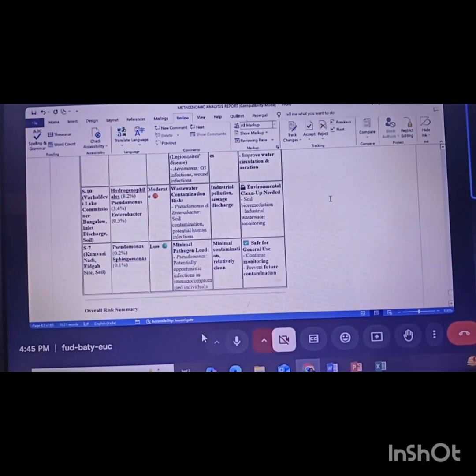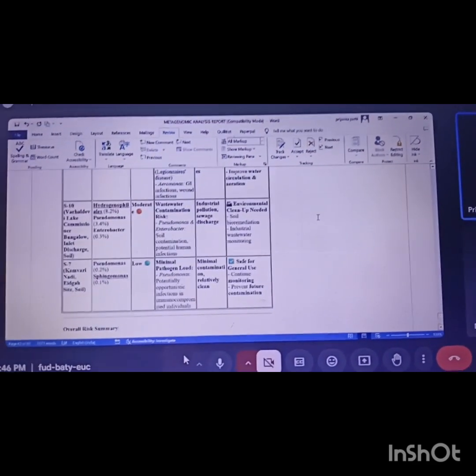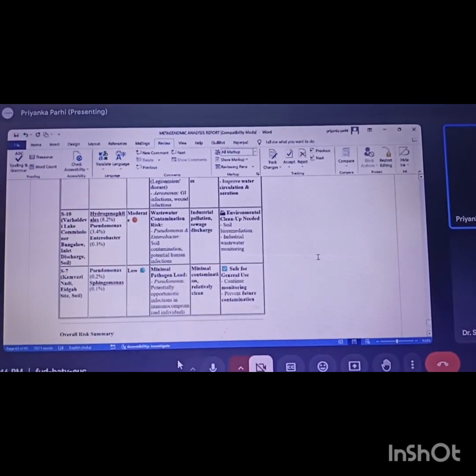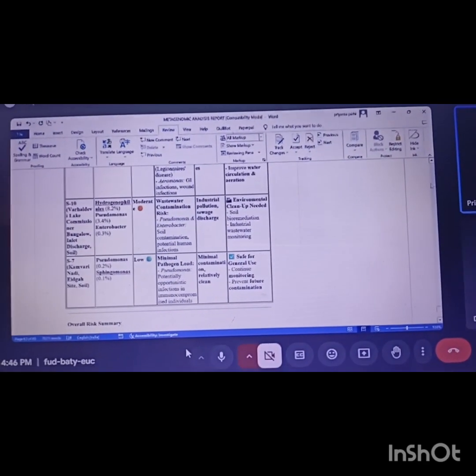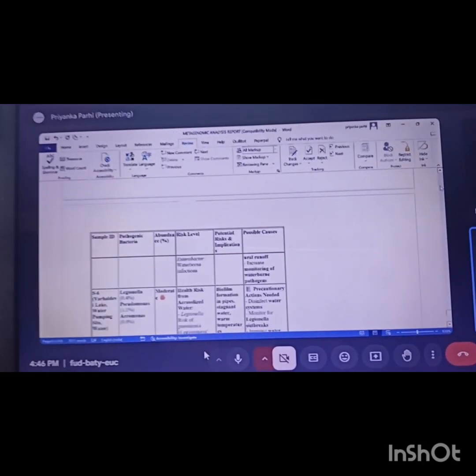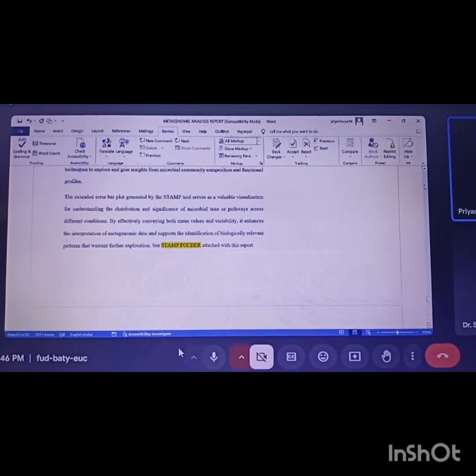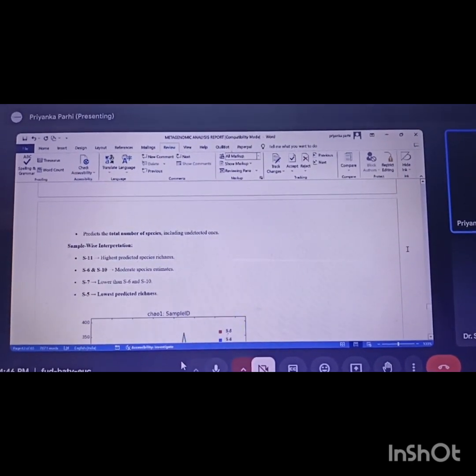Number of hits means again and again reoccurring, so repeatedly, stably occurring species. But if it were in percentage, okay, percentage you are saying we are not counting. That's why there is a different graph for different analysis.